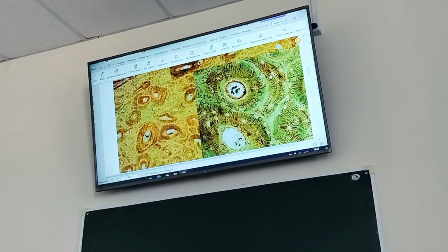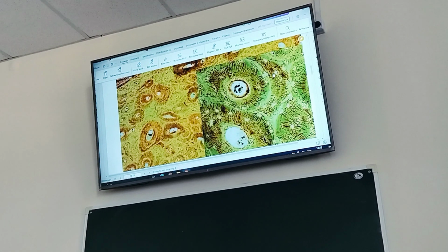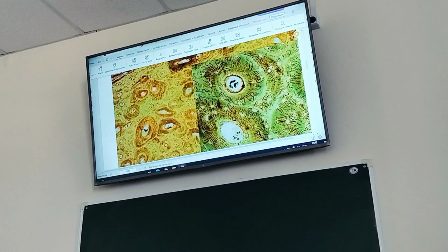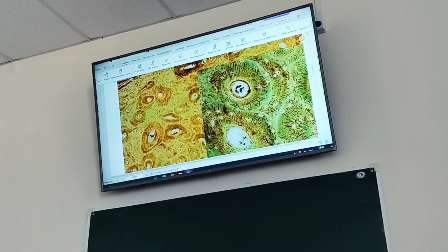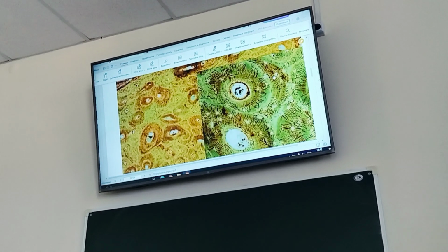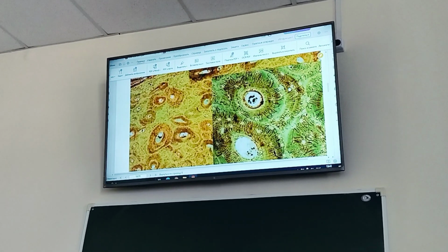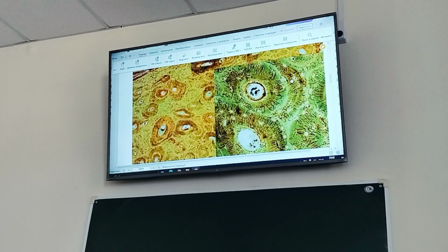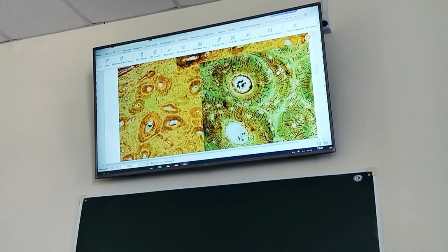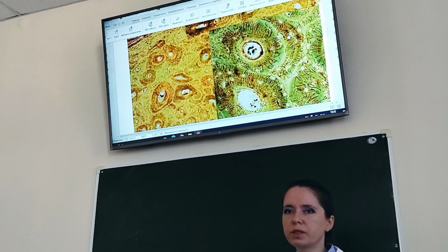What is this? Adipose. Bone. Yes, this is bone, but give the full title. This is secondary bone lamella, taken from a diaphysis of long tubular bone, decalcified, stained by the specific Schmorl stain. What is the most identifiable structure? I can recognize the Haversian canal and the Haversian system, a layer of concentric lamellae.